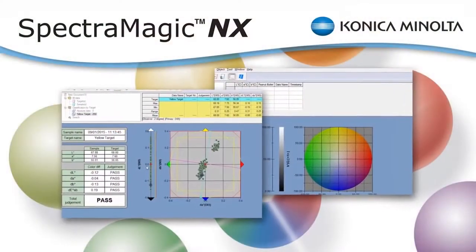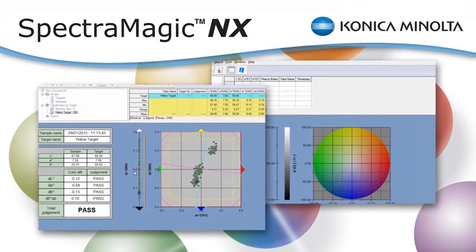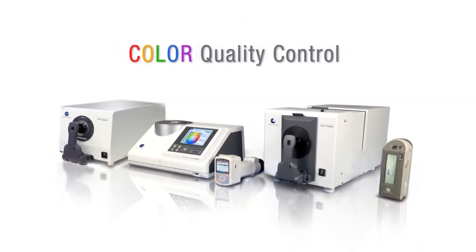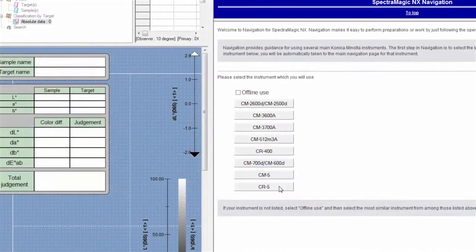Konica Minolta Sensing's SpectraMagic NX software is a complete quality control solution for the measurement and analysis of color. Use this powerful software with Konica Minolta Sensing spectrophotometers and most colorimeters.